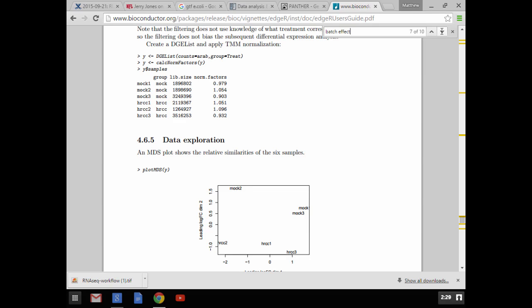Everything that's scripted here you can do interactively in R, similarly to what you may have done if you were playing with Python in other workshops, where they are Python notebooks and those kinds of things. Type one thing, hit return, it'll give you a reply, and run through things individually. And then if you really want to run the analysis again, you can copy and paste through.